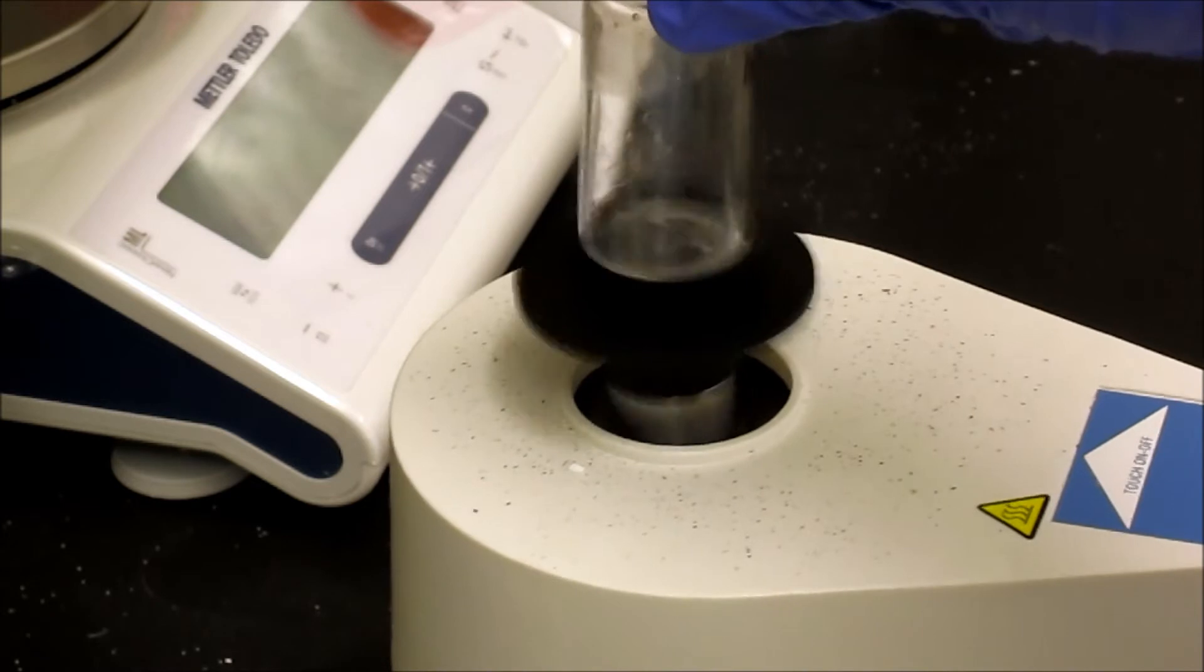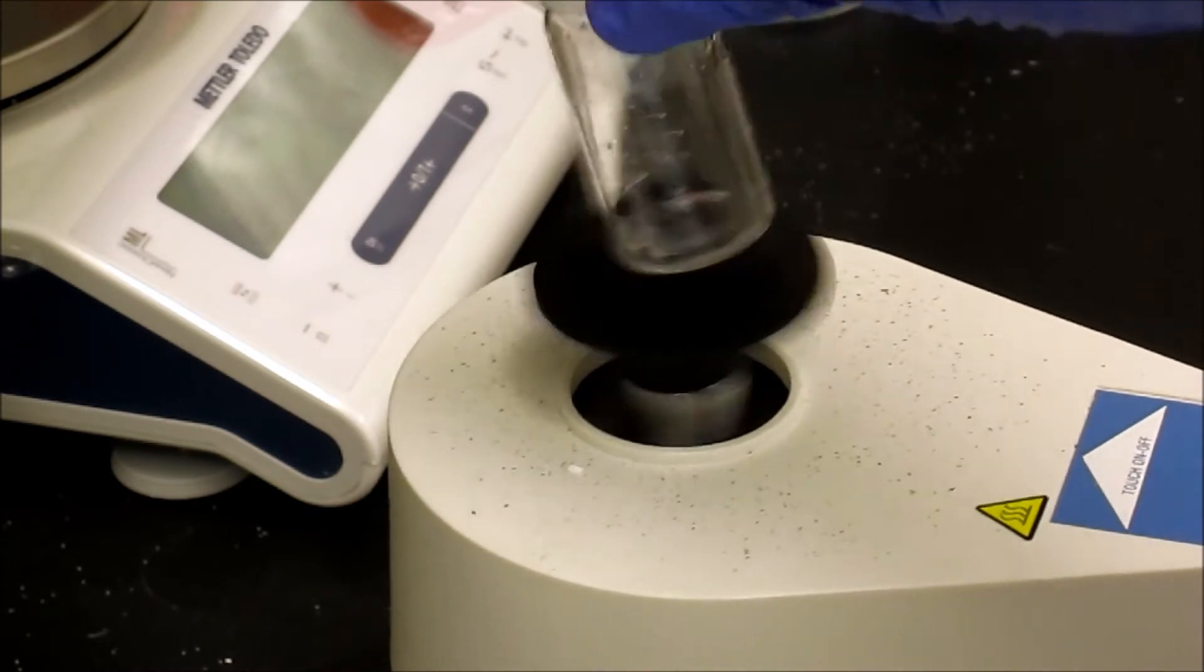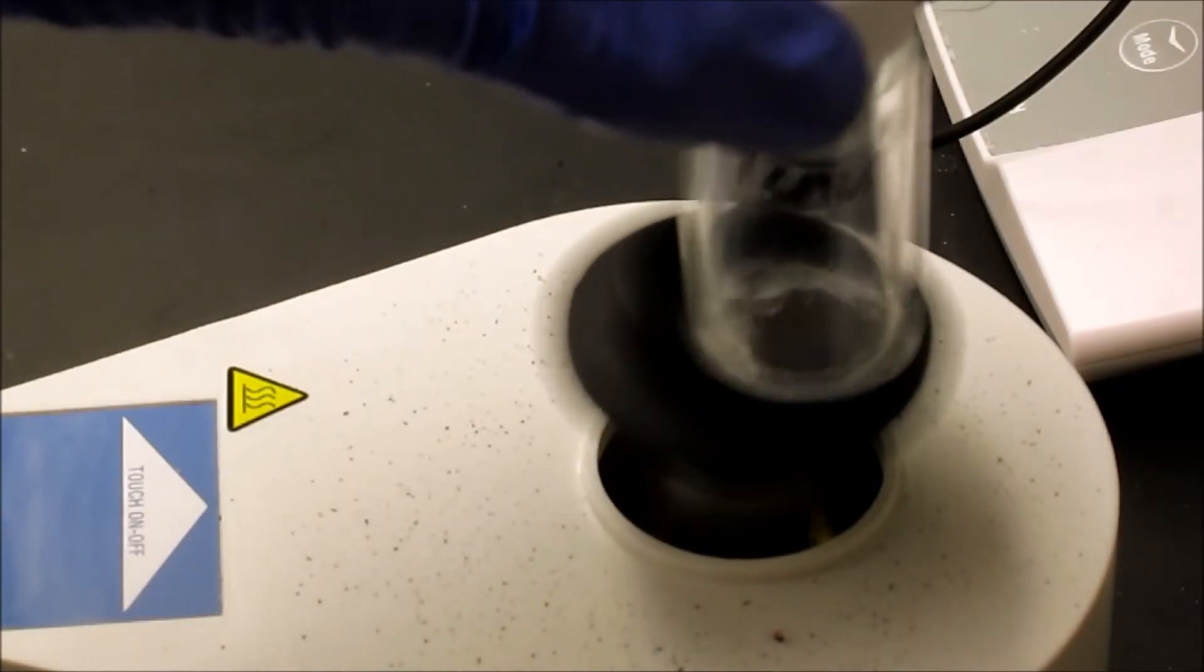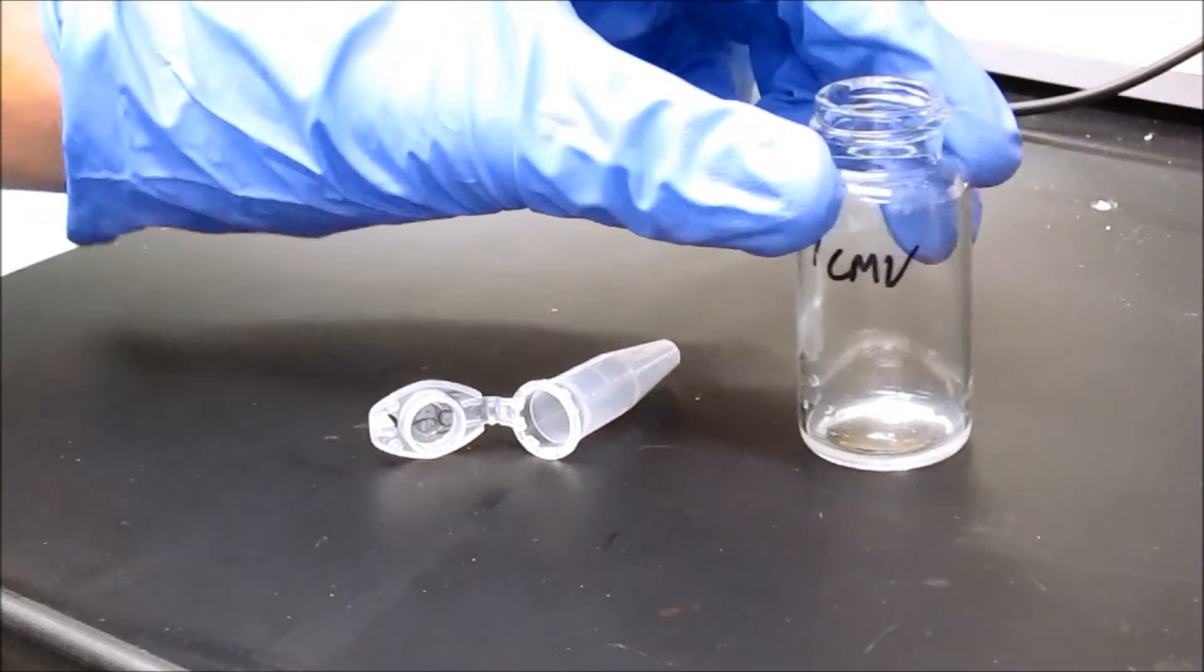Then, each vial is vortexed for 10 seconds every 10 minutes for 1 hour to ensure complete hydration of the lipids. The solution in the vial should appear cloudy indicating the formation of liposomes.